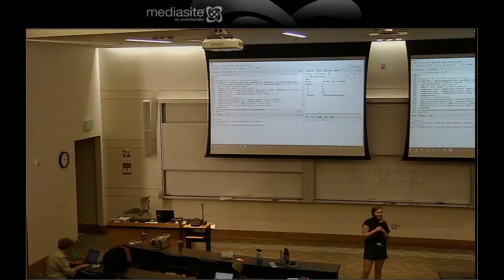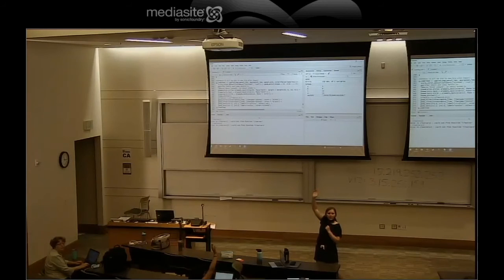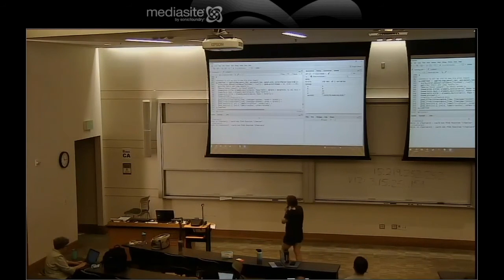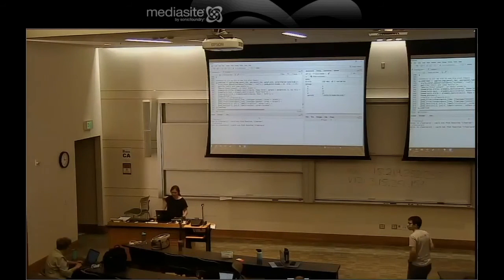Raise your hand if you're on section 4 or 5, which is tidyverse and ggplot. Are you on 4 or 5? Most people. Okay, most people, you can keep working, but I want to go over what goes into featureCounts as you're finishing up.